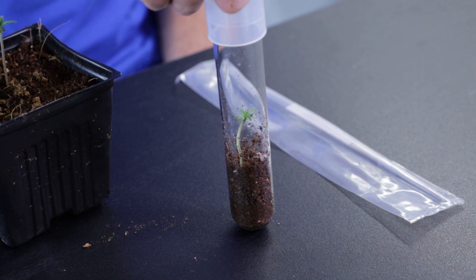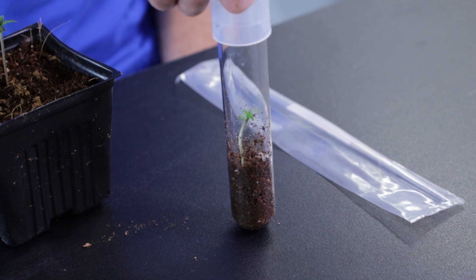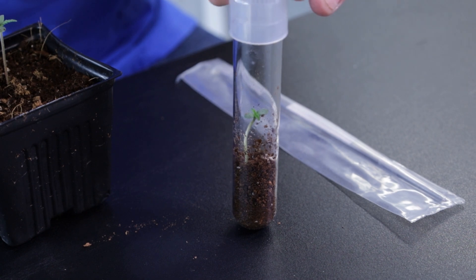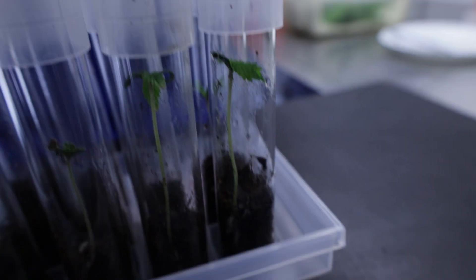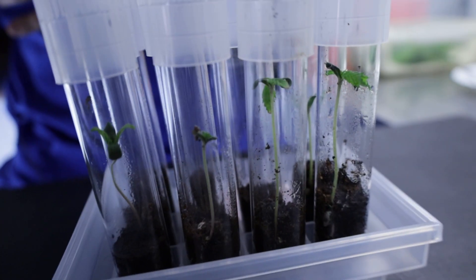So we're looking for this type of germination. This is sterile. This is the best chance your seedling has germinating in a sterile mix, especially if it's valuable or at risk. That's the seedling we want to have.